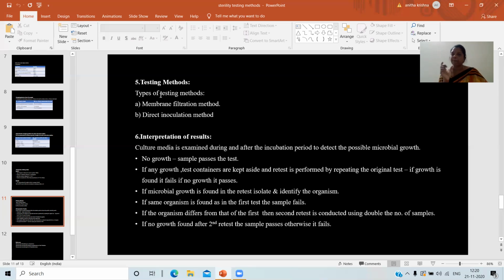If the product is an ointment or a cream or emulsion, then we have to take the required quantity of the product, heat it to not more than 40 degrees, and then dilute it with suitable diluting agents such as isopropyl myristate, if it is necessary, to maintain a concentration of 1% weight by volume. After that, the procedure is the same. You have to filter it rapidly through the filter membrane, wash it with fluid B, and then go for the cutting process and separately incubate it.